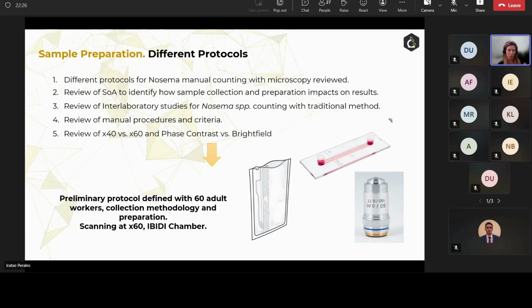So there's no problem with using it many times. And also we recommend using a stomacher bag with 200 microns pore size, because when you filter the sample, it makes the sample, let's say, a little bit cleaner.